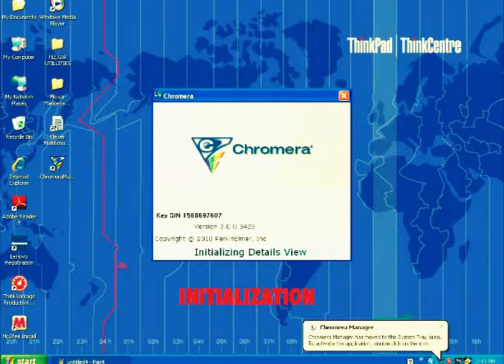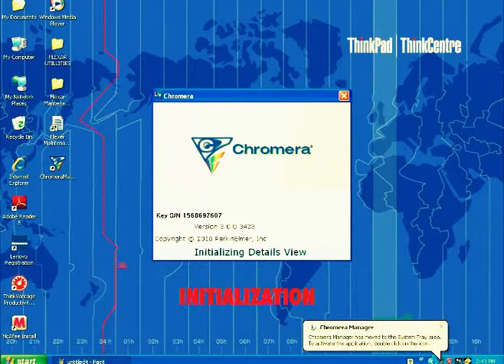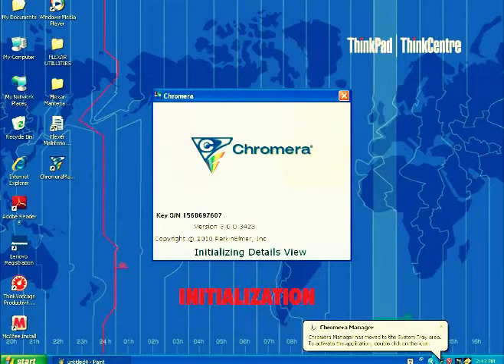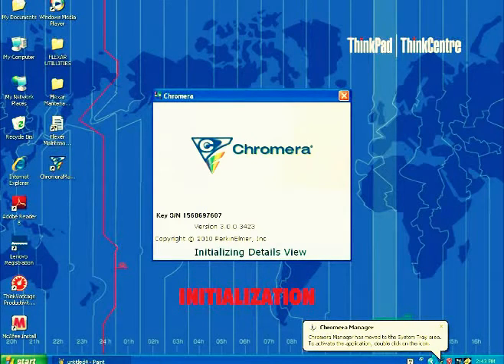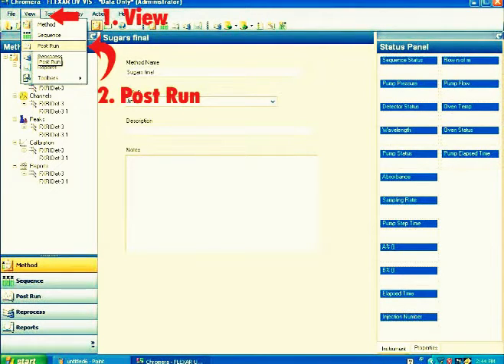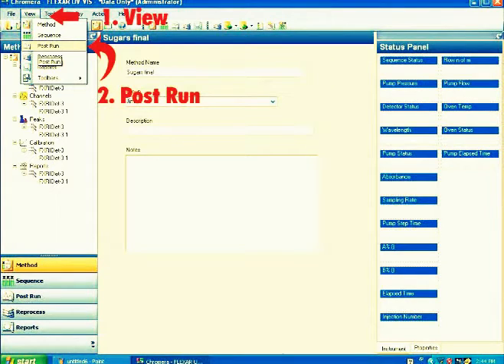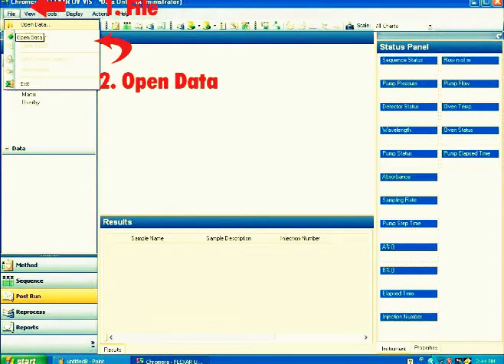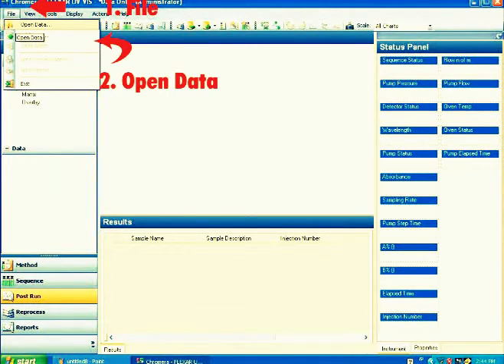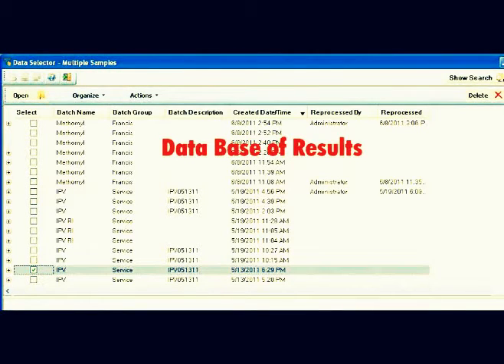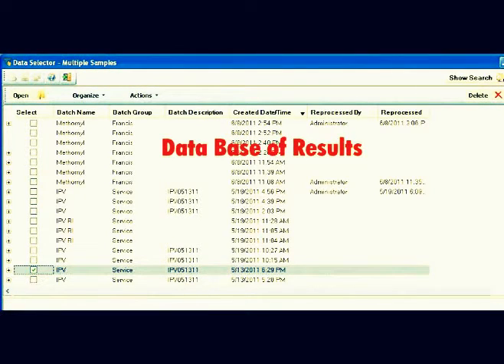A box will appear showing initialization of the details view. Once it opens, from the Control menu again, click View. Under this, click Post Run. Now you can access the result chromatogram. Just click the File menu, click Open Data. You can now see the data saved of your sample. Just click the item and it will automatically open the result data.